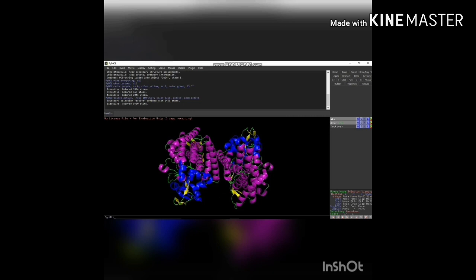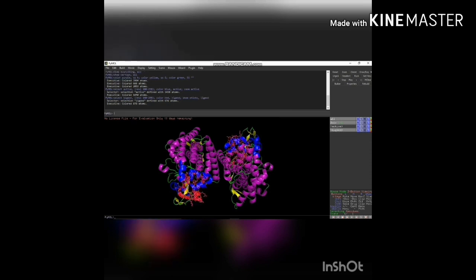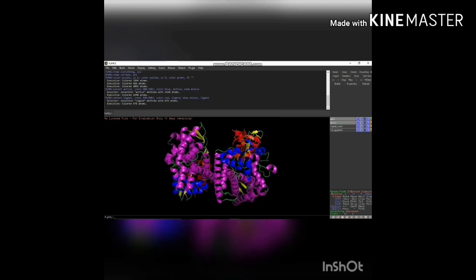Then you can also identify the ligand, which is nothing but small molecules. Give the command: select ligand, resi 150 to 200 — you can specify any residue range as with the active site. To differentiate the ligand molecule using color, I prefer red. Give the command: color red, ligand. Then give: show sticks, ligand. The ligand molecules will be shown in the sticks model in red color.